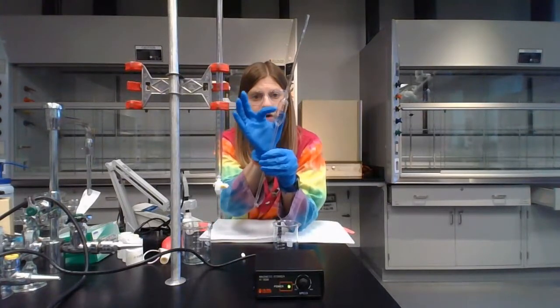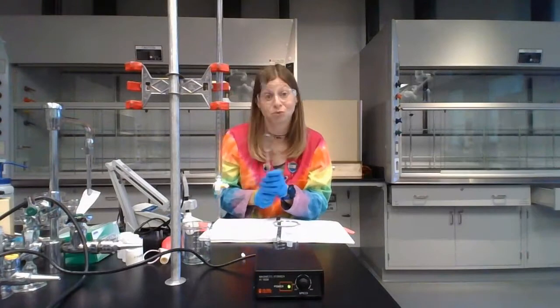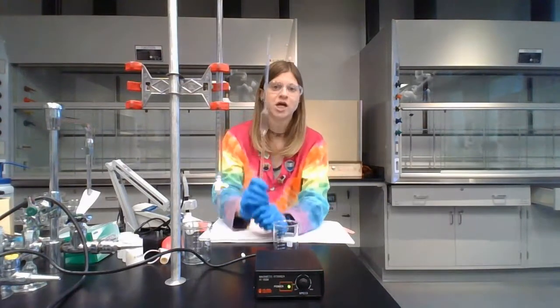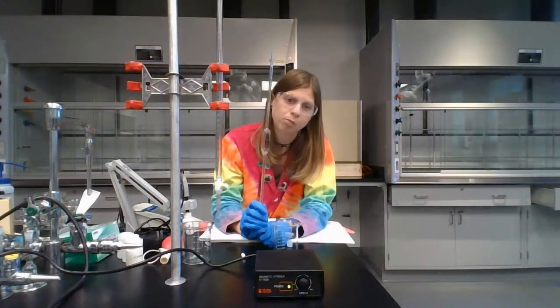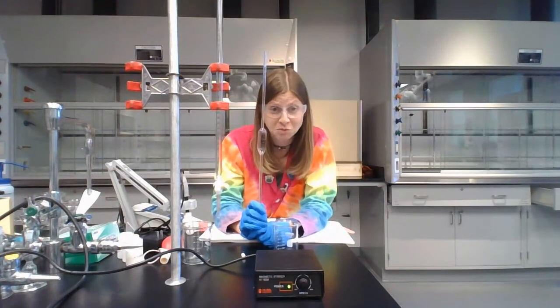The bulb part right here, the glass is very thin, so it's easy for them to break. They're also super good at rolling. So if you set them on the counter, they're just going to roll right off to the floor. So make sure that you're really careful with them. I would suggest pipetting all 3 trials at once, so then that 25 milliliter pipette can be put away in the appropriately labeled container for our lab tech or lab coordinator to wash it. You're not responsible for washing it.